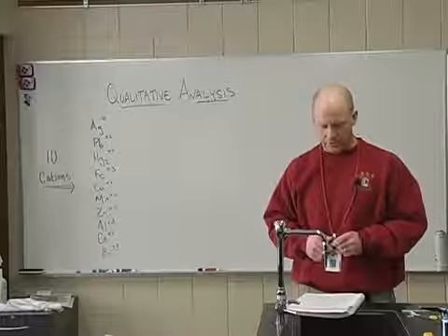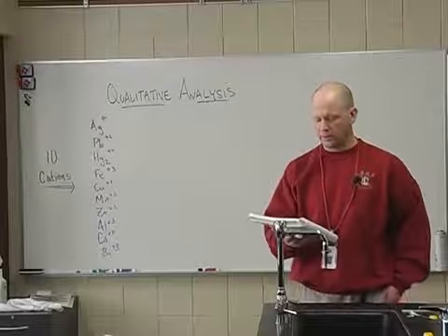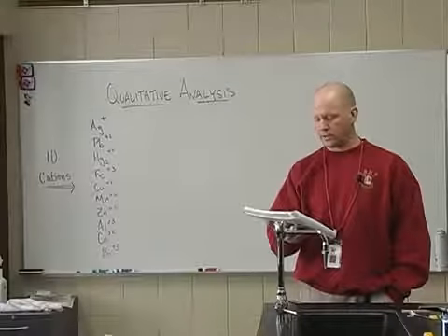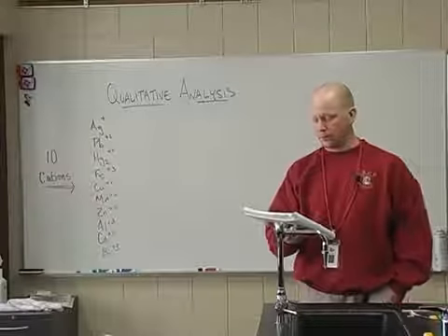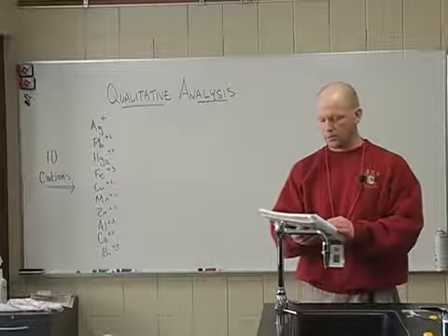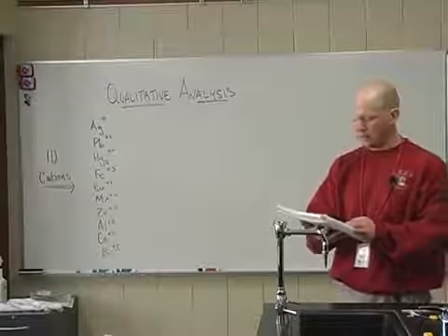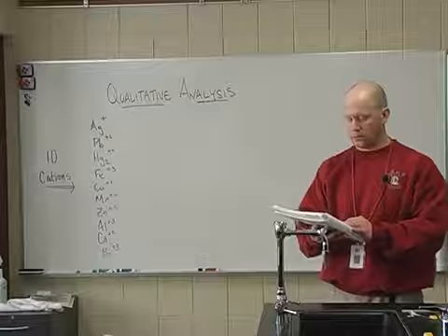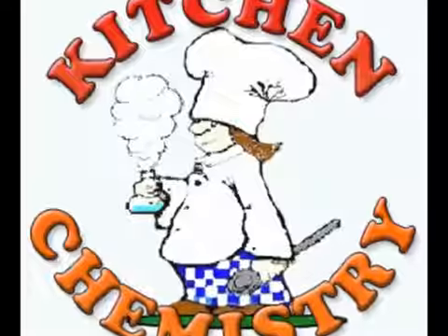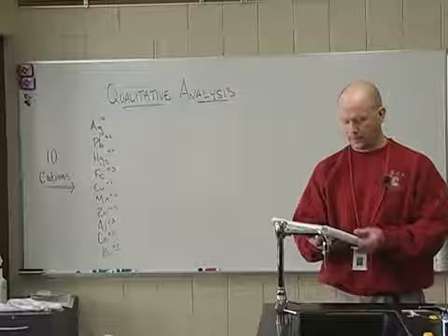This experiment is carried out on a semi-micro scale. Very small quantities of reagents are used. Cleanliness and a great deal of care are necessary to obtain good results. As you go through the steps of the analysis, keep a copy of the flowchart available for reference. The flowchart appears at the end of the experimental directions. It will help you see the total picture of where you are and where you're heading. Read the directions carefully and read the sections which give the notes or the chemical theory for each step. Don't just follow the directions cookbook style, but make an effort to understand the principles of chemistry behind the procedures.